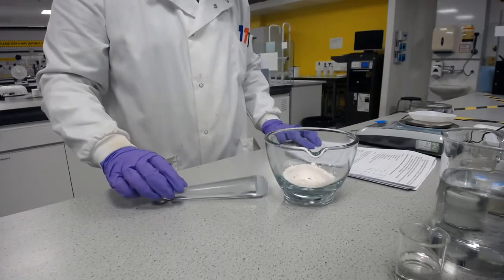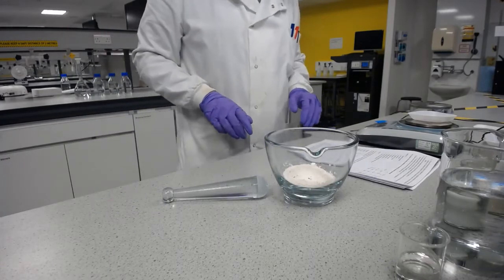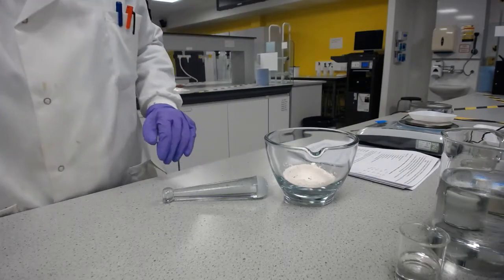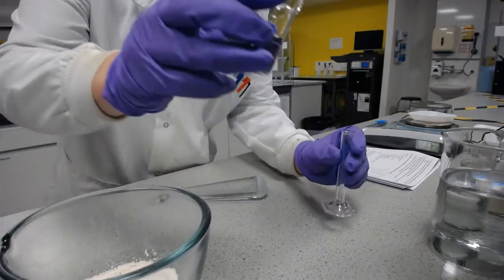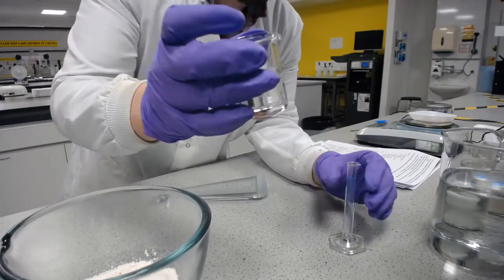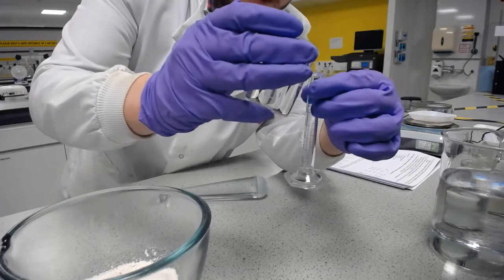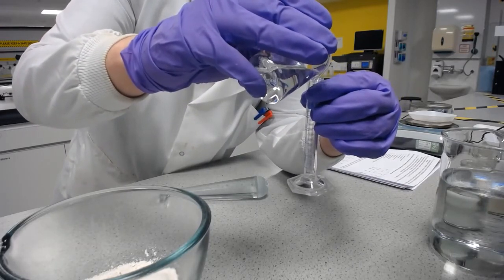And then using a measuring cylinder, measure the glycerin. Okay, so glycerin is really, really viscous. And let's see if I can do this in front of the camera. It's very gloopy, viscous liquid. And so to measure it accurately, we must be patient. And I'm just going to pour directly in.